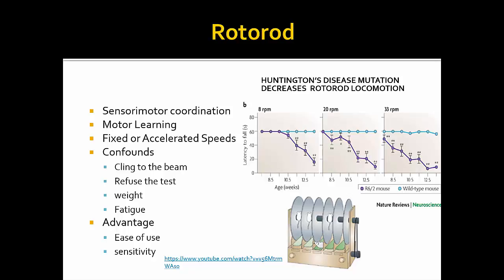We had one when we just did this. After TBI, he learned that if he waits for the wheel to go backwards to a certain spot, he'll let go with his back legs, hold on by his front, and then let go and drop into the cage underneath him. It's really interesting because I talked about this one and thought, oh, this is easy enough, and then I actually did it. We found out that we couldn't do 3 days of pre-training, because by the third day, they would twist their bodies and refuse to go inside the thing.